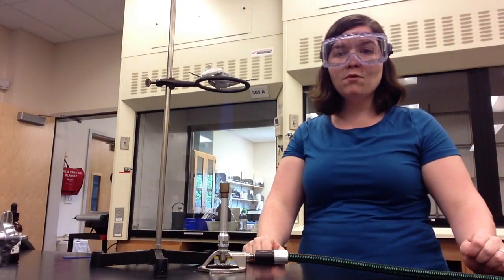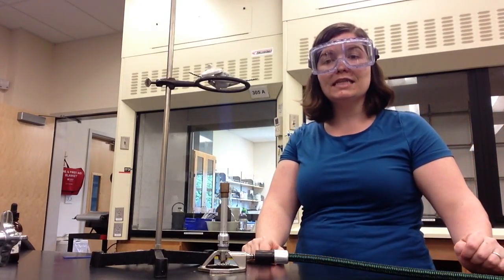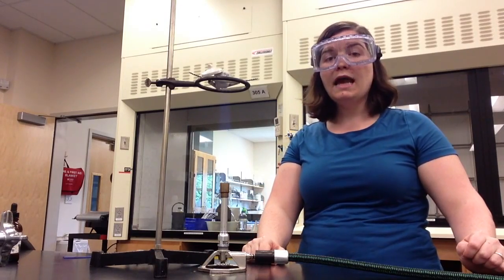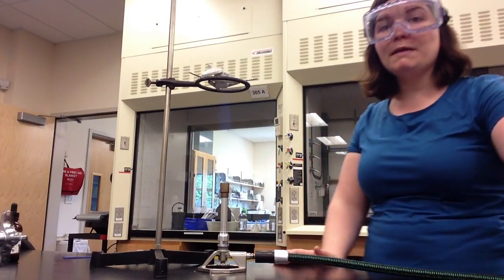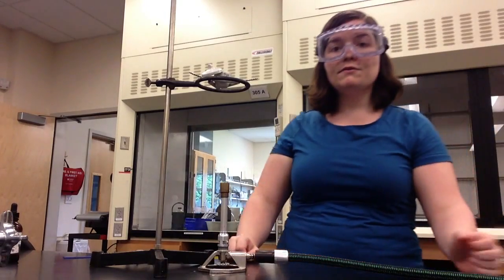I'm then going to heat strongly for 10 more minutes, which will allow the oxygen to leave the potassium chlorate. At the end of 10 minutes, I'll turn my Bunsen burner off. I'll then allow the crucible to cool, measure and record the mass in my data table.